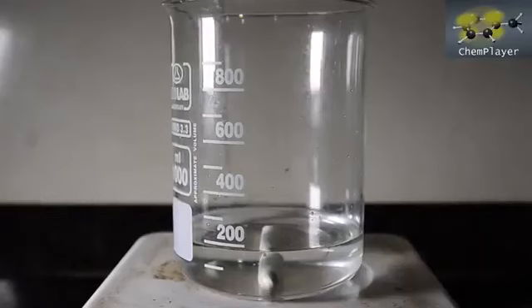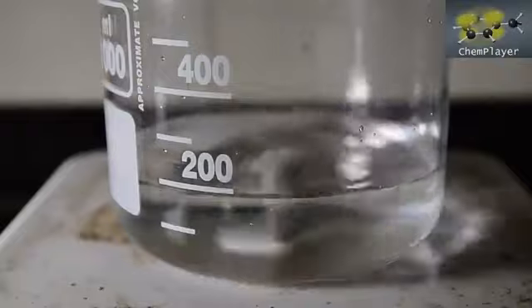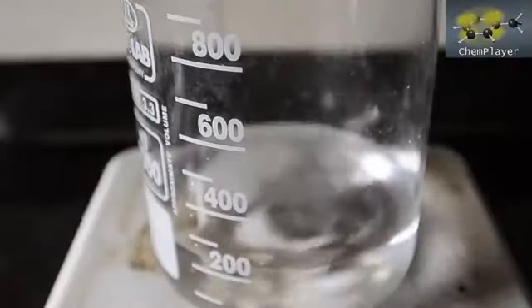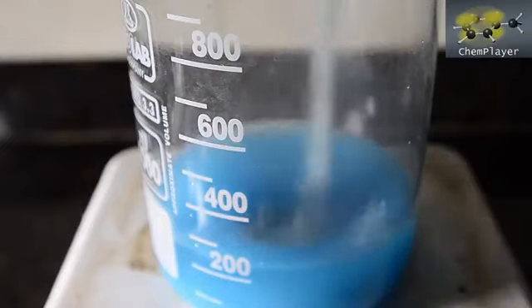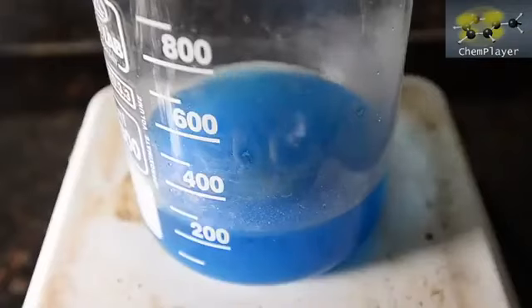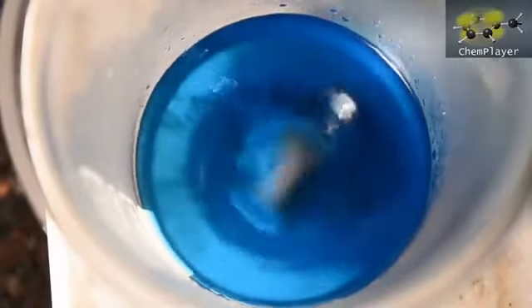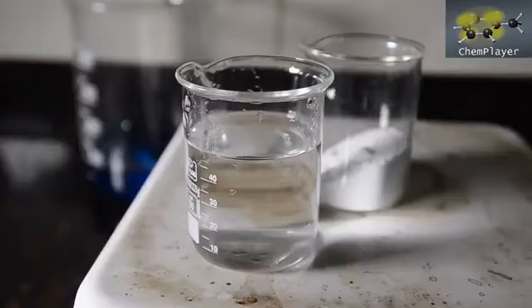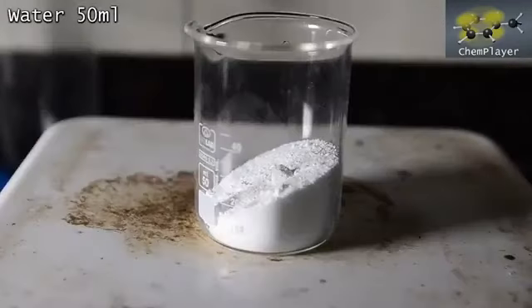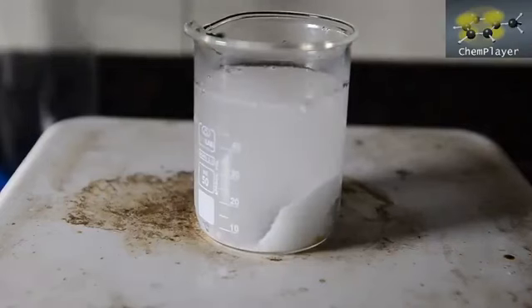So let's do it. First we've got a large beaker set up containing 200 ml of water and strong magnetic stirring. Copper sulfate first up. There's a slight exotherm as the anhydrous salt dissolves, but the dissolution is quite rapid. Looking good. Now for the sodium bisulfite. We can dissolve this pretty easily in about 50 ml of warm water. Just a minute and we're there.